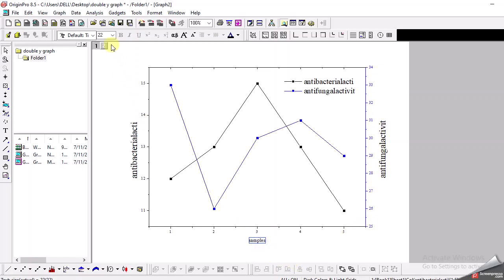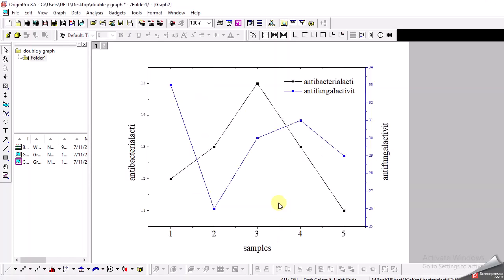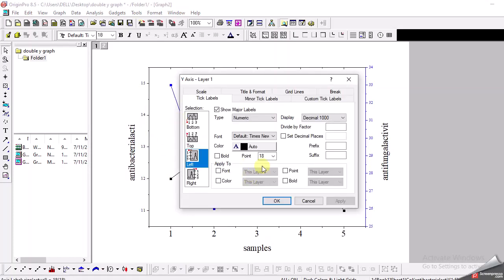So these are the sample numbers. Here also I increase the size to 36. And also definitely you can increase the size of these labels. And here also I suggest to have 36 number which makes it clear. Here again I change it to 36.